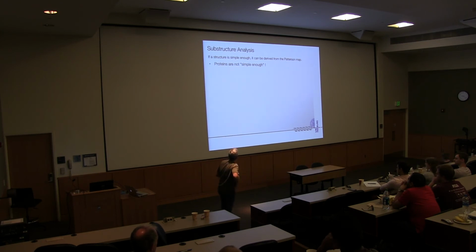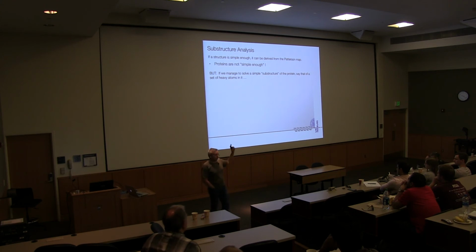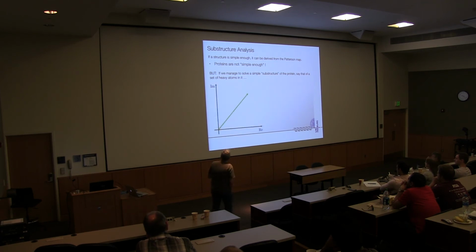And that sounds a bit like magic, but that's what we're going to show you in the practicals, where we're going to solve this structure of the ferredoxin I had on the slides very early on by using the positions only of the iron atoms in the end. And I'll just show you this picture, and then I really stop it here.